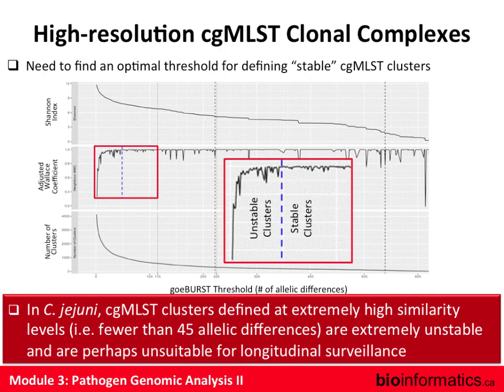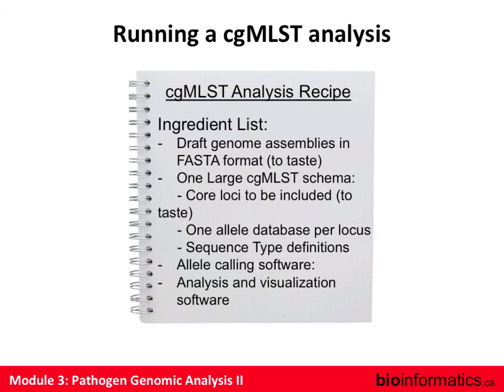Okay, so how do you do cgMLST? So there's your ingredient list, you can read that up. But basically you need genomes, you need a scheme, someone's gotta come up with it. Again, it doesn't have to be you. Some people are developing programs to be able to design a scheme. These people should be applauded. But most times you won't be the one doing that. If you have genomes and a scheme, there are programs that will then let you type that data.